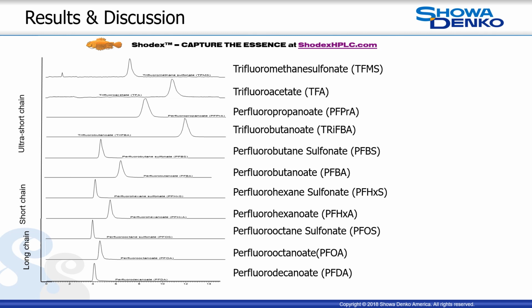The method was unable to detect DFA on all instruments, but it was detected during method development by LC-MS. Although MFA was not detected under the current method conditions, it is possible that further optimization of ionization may allow detection of the remaining ultra-short compounds. Chloroacetic acid species had similar retention characteristics to corresponding organofluoride acetic acids during method development.